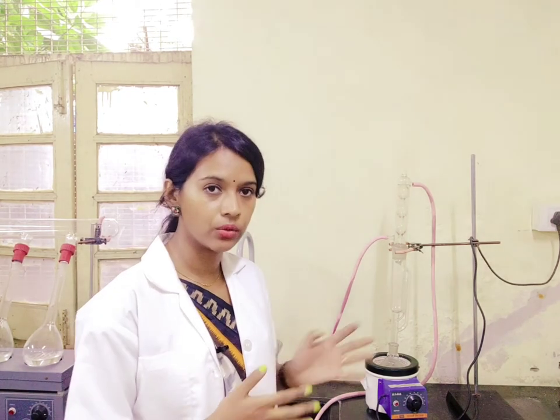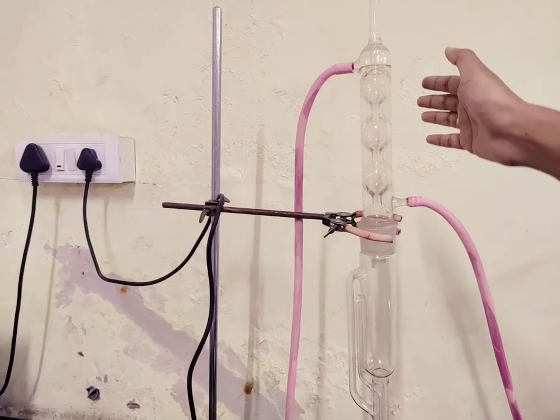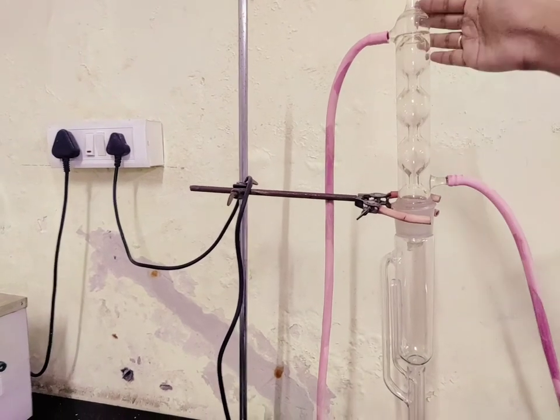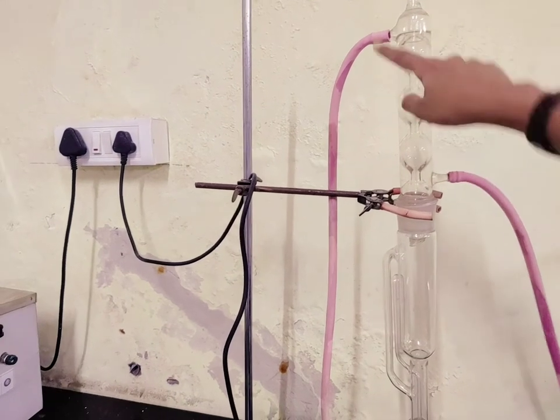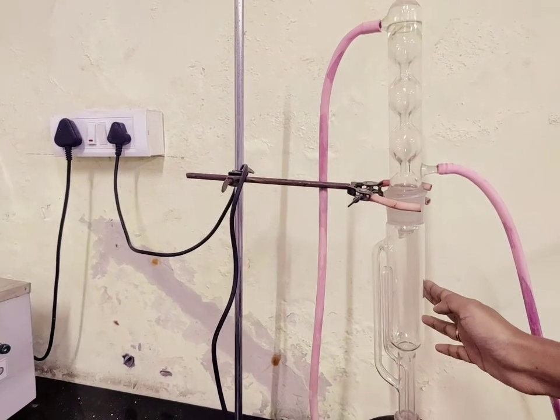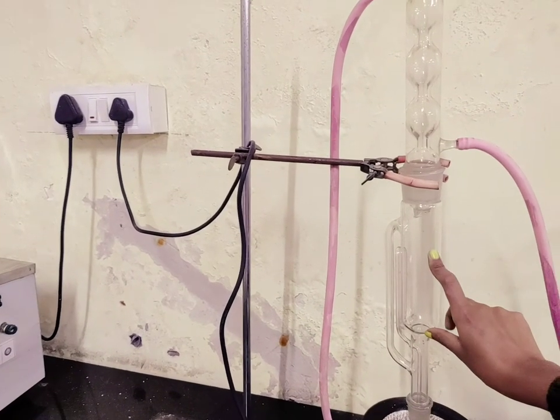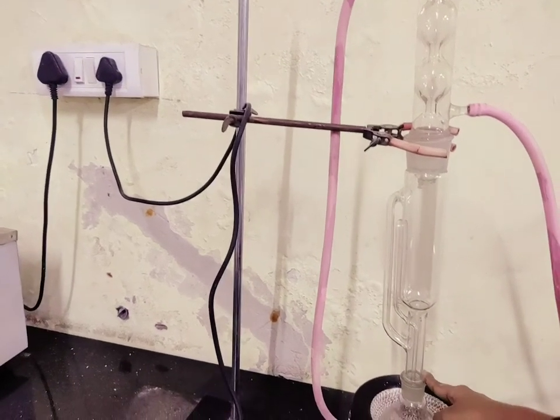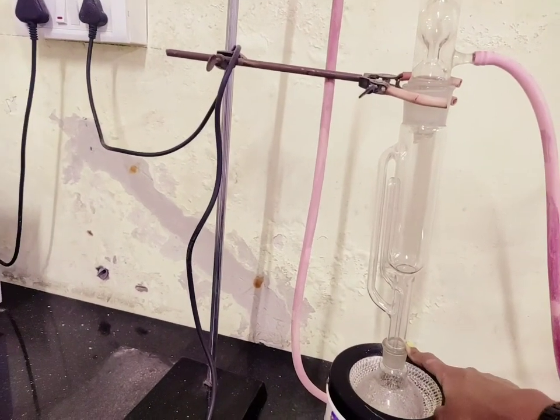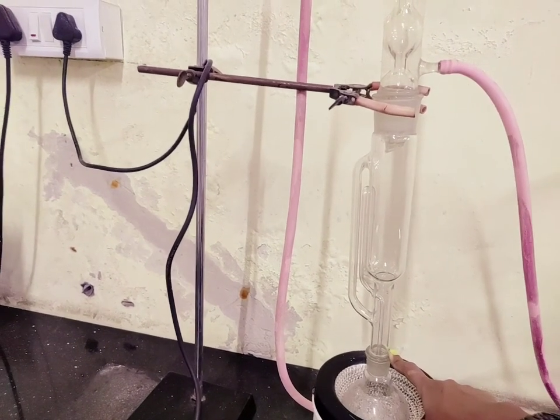Now I will show you how it looks from a close view. You can see this is the condenser tube where continuously cool water will be running — one is for inlet and the other one is for outlet. Then you have the Soxhlet chamber, and inside you have to keep your sample in a thimble, which is a thick filter paper. Once you have placed that in, you place it on a solvent flask in which you take the solvent to extract the fat from the sample.